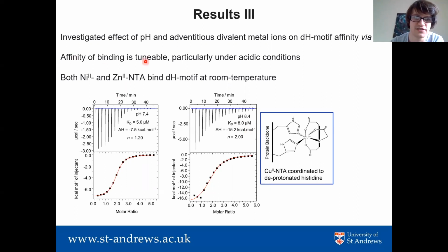This is something that we're actively pursuing, but the larger implication is that this affinity of binding is tunable, especially for acidic conditions, but as well, you see that there may be some saddle point or optimal pH where you really want to measure and to optimize your labeling efficiency.